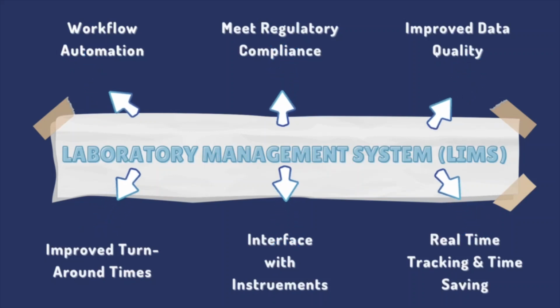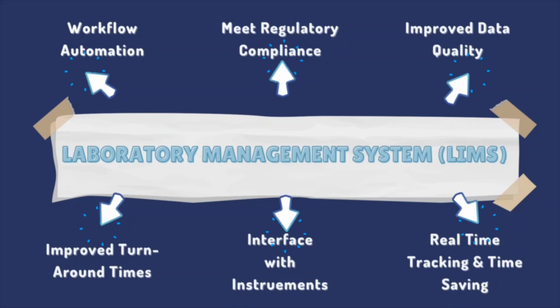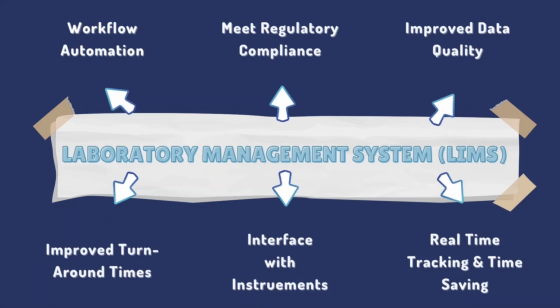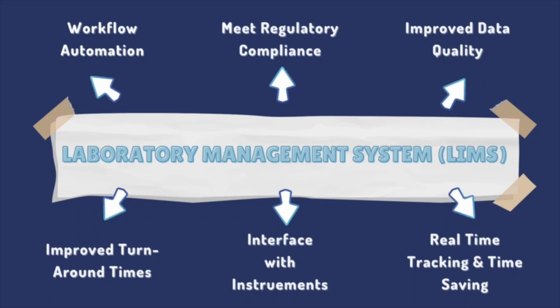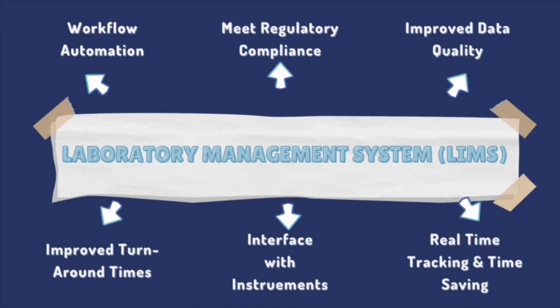Laboratory Information System is software that is developed to support laboratory operations. It can record, manage, and store data for clinical laboratories, and traditionally it is adapted to send lab test orders directly to lab instruments, track those orders, and then record the results, usually to a searchable database. LIMS serves the main purpose of enhancing efficiency in laboratory functioning by cutting down manual tasks.